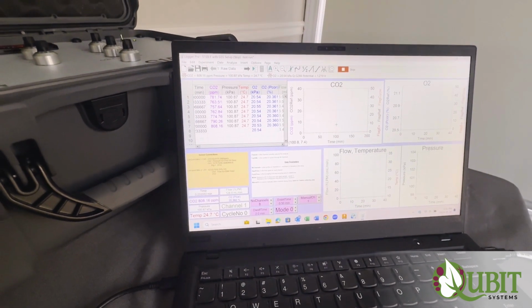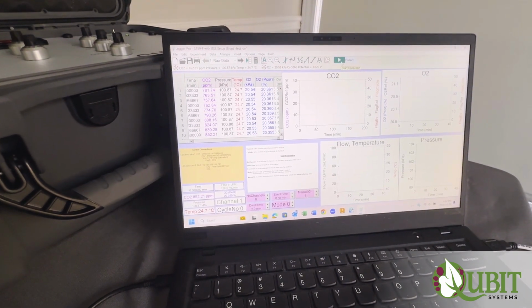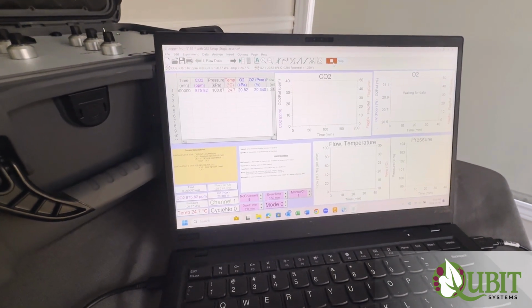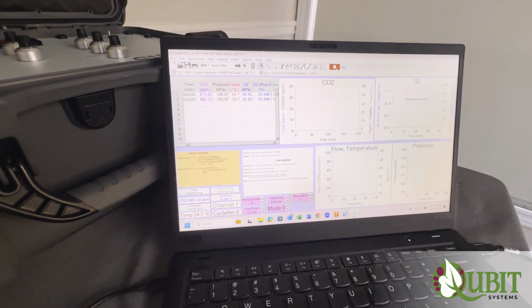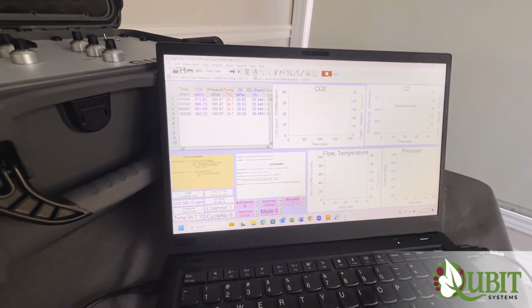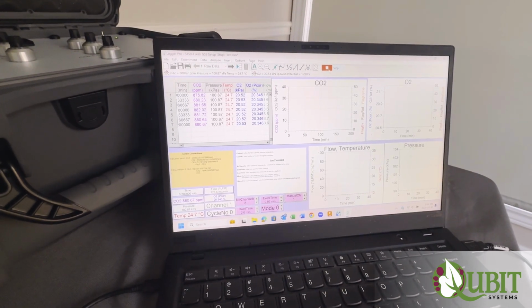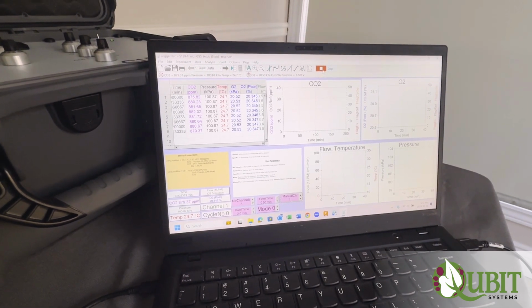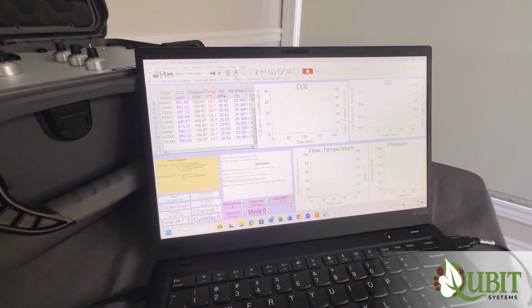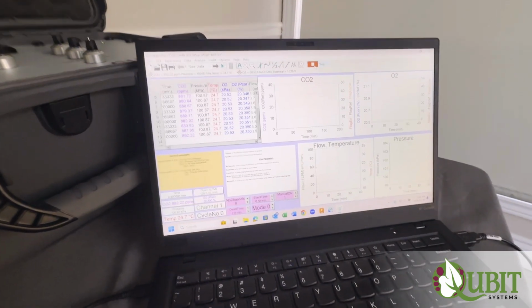Sometimes when you start collection, you may see a message, which it didn't show this time, asking whether you want to append to previously collected data or start fresh by erasing and starting again. We recommend that you always erase and start again, and do not append, because the software will get confused in terms of what channels are being used. To finish data collection, you click stop.